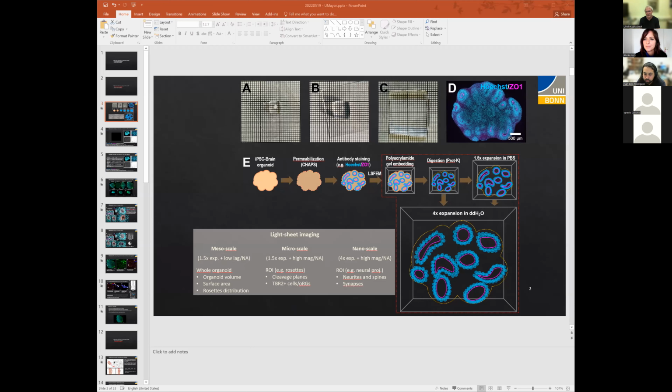To extend that point, there is one advantage in using only one channel at a time, and that is the alignment of the images. In that case, you illuminate your sample and you detect the same region, so you can be sure that they are perfectly aligned. In case you use several cameras, you have to align your channels posteriorly, and that might produce problems.